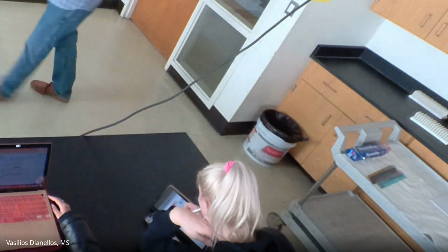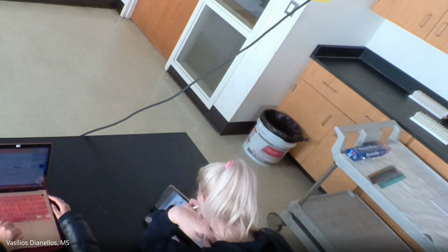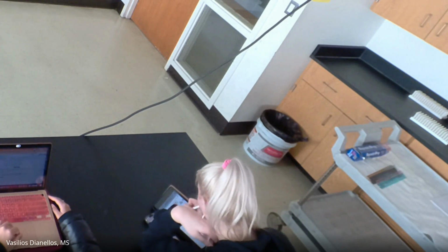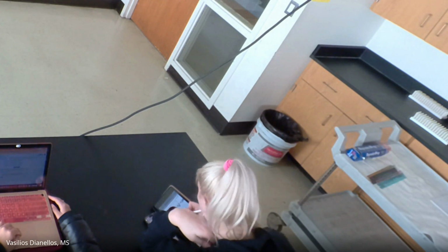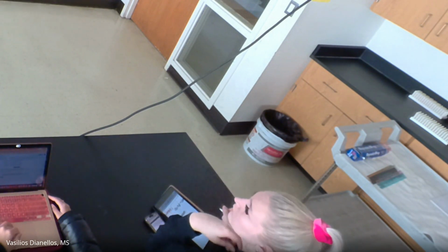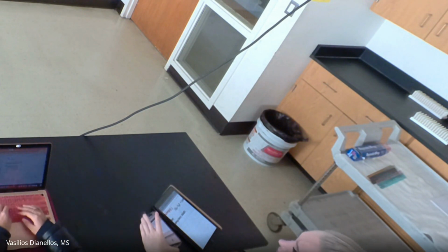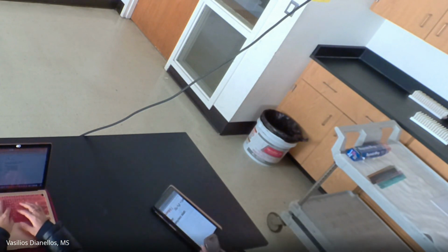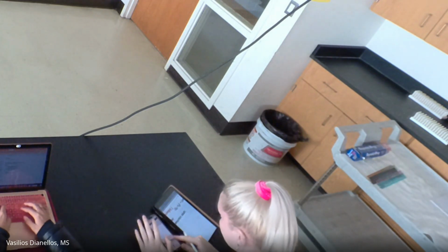Does that make sense? All right, so again, what we're looking for in this case is for the pH to increase. Because if it increases, right? All right. I'm sorry. No, that is right. Yeah, the one in the dark. Sorry. There's also going to be one in the dark. That's our control. The dark one is not getting any light. Therefore, in theory, it should be doing respiration, not photosynthesis. Therefore, that's the only one that should be going down. Right? The rest of them, we should expect an increase in pH, meaning the photosynthesis is happening. Does that make sense to everybody? All right.